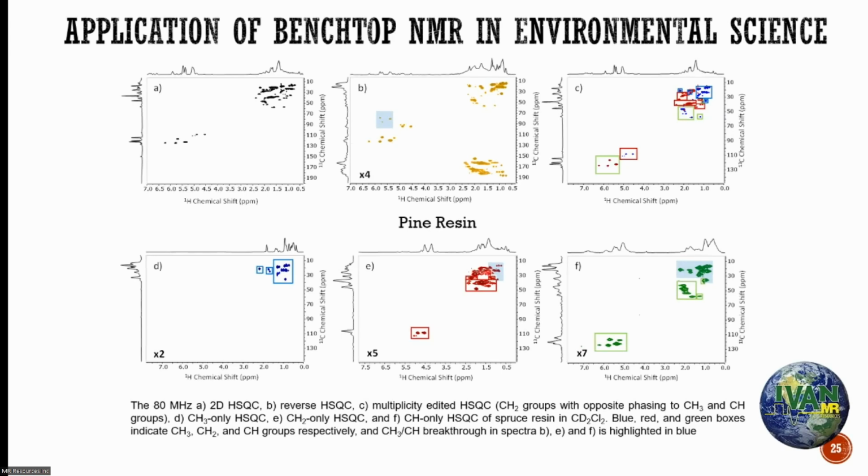But having said that, we see that there's some breakthrough in our selection process. So it's not perfect, but having said that, this is a great advancement in terms of really being able to get the resolution that we need in 2D, and able to apply 2D NMR at the benchtop NMR level with the sensitivity that one needs to actually do some assignments.